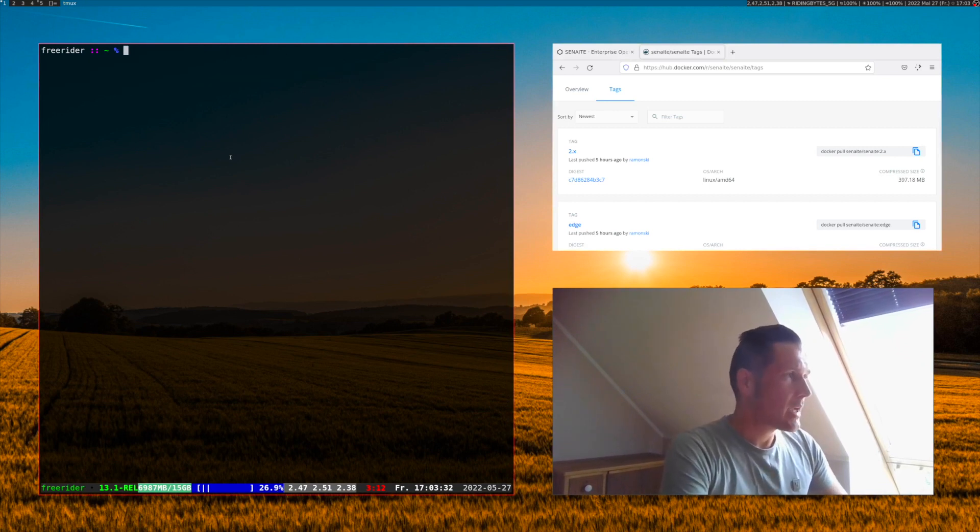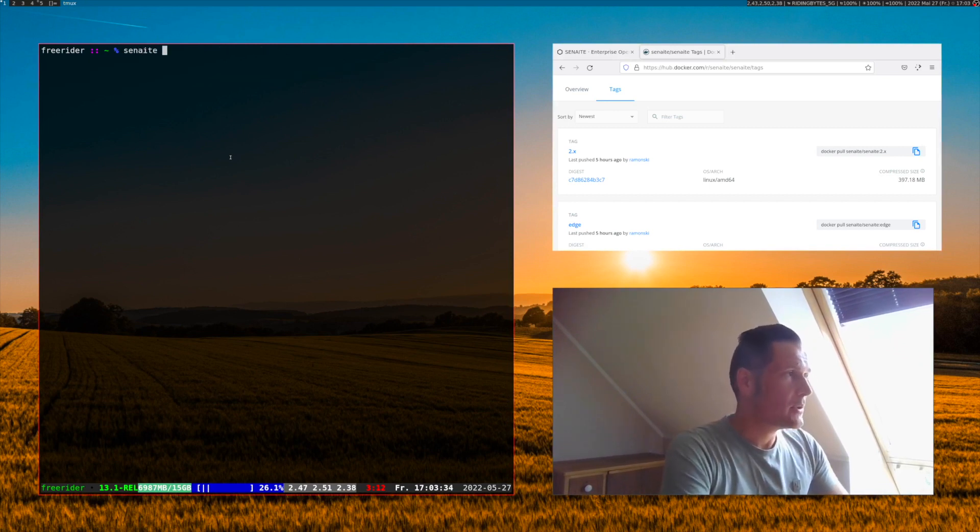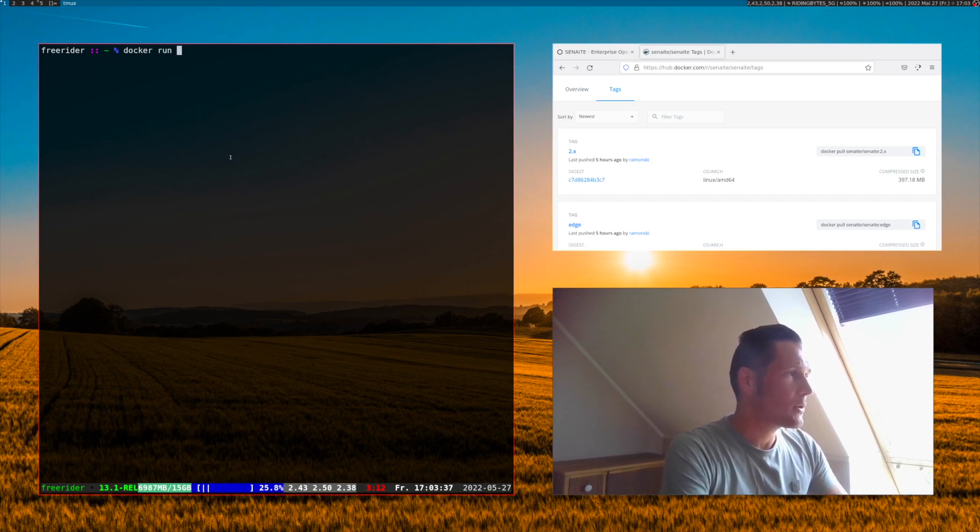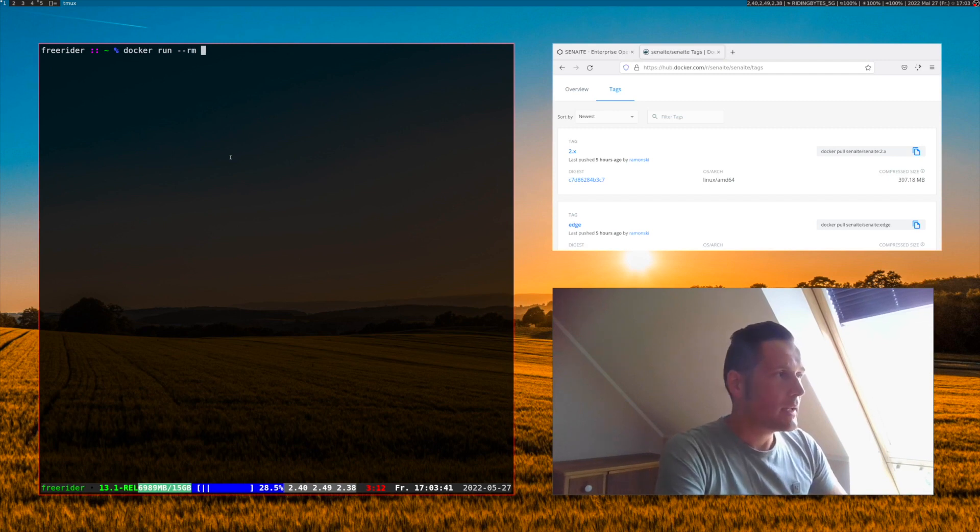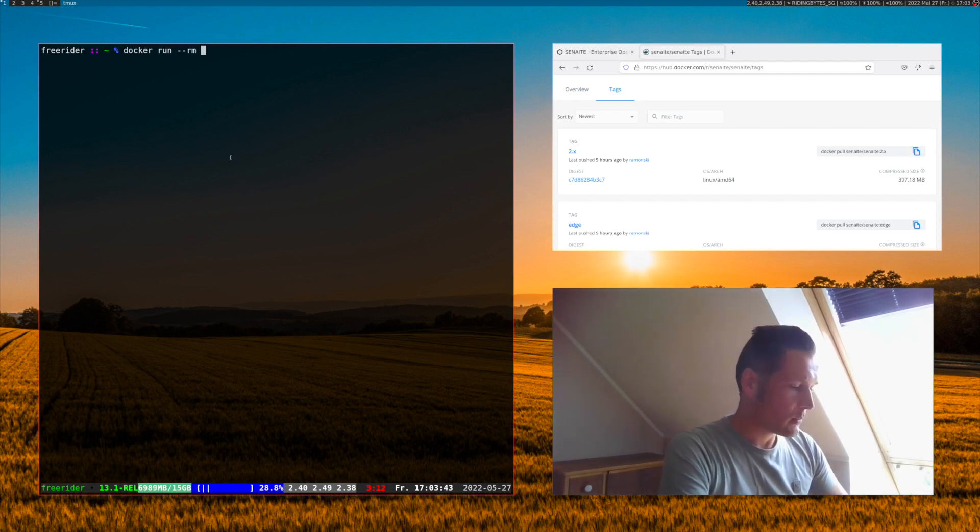Now it is time to run the container. Therefore we use the Docker run command. We say we would like to delete the container after it is stopped because we don't need it anymore.